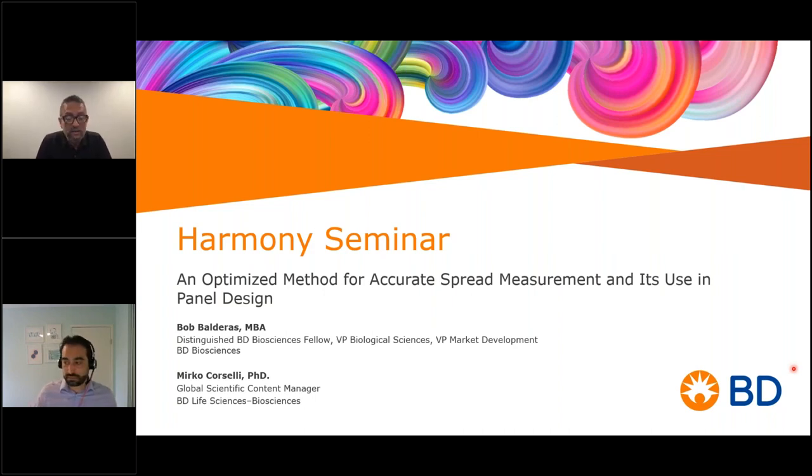Well, the program that you're going to hear today continues in this direction of education, and it has a focus on a better understanding of an optimized method for accurate spread measurements, as it says in its title, and its use in panel design. And this topic is very, very important. Again, it's a process of education where we discover something and use it, as we've used our spillover spread matrix for a number of years, until we get to a point where we learn something different and we begin to see something. Then it requires that depth of discovery to be able to unravel that information and to better put a new foundation on it. And that's exactly what Mirko has done for us. It's just a great pleasure to have Mirko roll this new concept, a new perspective, out.